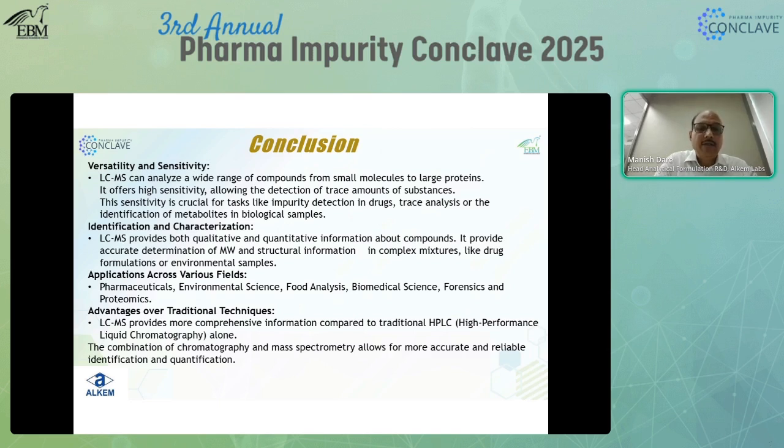And the identification and characterization is also very important, to make it known, of this impurity from NTA to SSA or target compound. Once we identify the target compound with the help of mass spectroscopy, then other software and advanced techniques help us to illustrate the structure and inform the agency to get the proper approval for this particular known impurity.